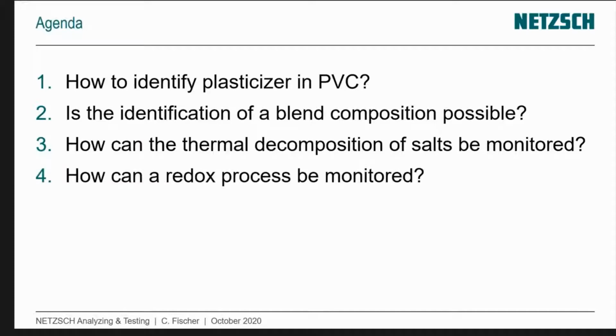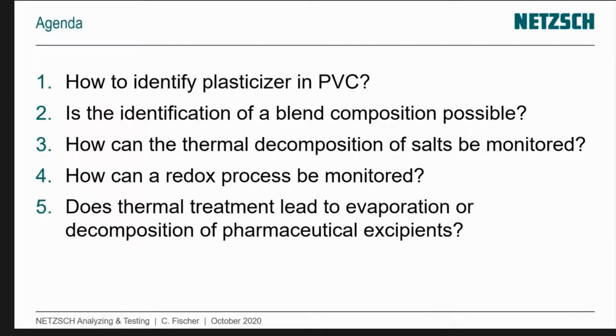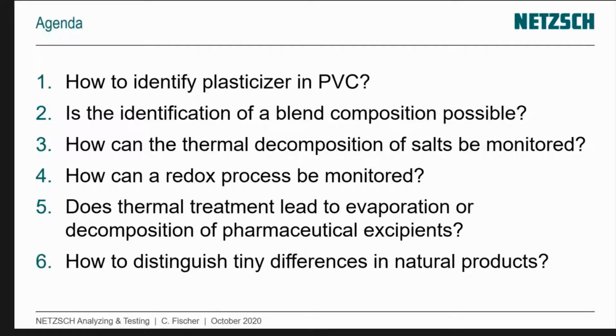Question 4: How can a redox process be monitored? Question 5: Does thermal treatment lead to evaporation or decomposition of pharmaceutical excipients? And last question for today: how to distinguish tiny differences in natural products.